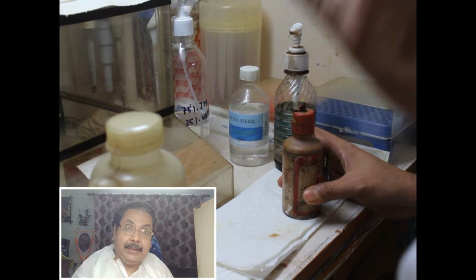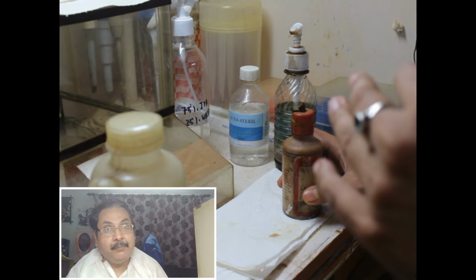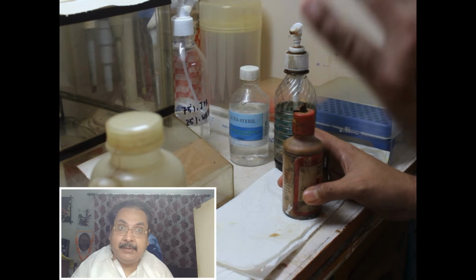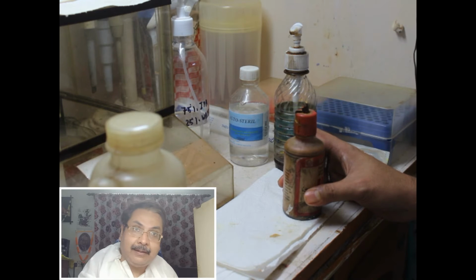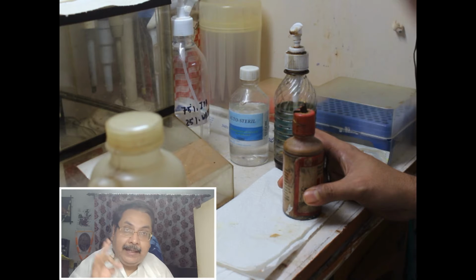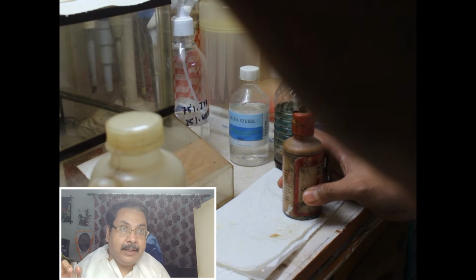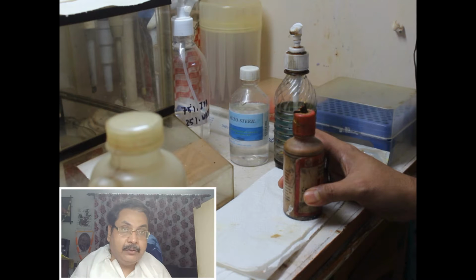So when the color goes from green towards red, that means the water is acidic. So acid is present in the water. And when the color goes from green towards blue or violet, that is alkaline water. So that also should be avoided. Neither should it go towards the red region, nor towards the blue or violet region. It should be in the green area.